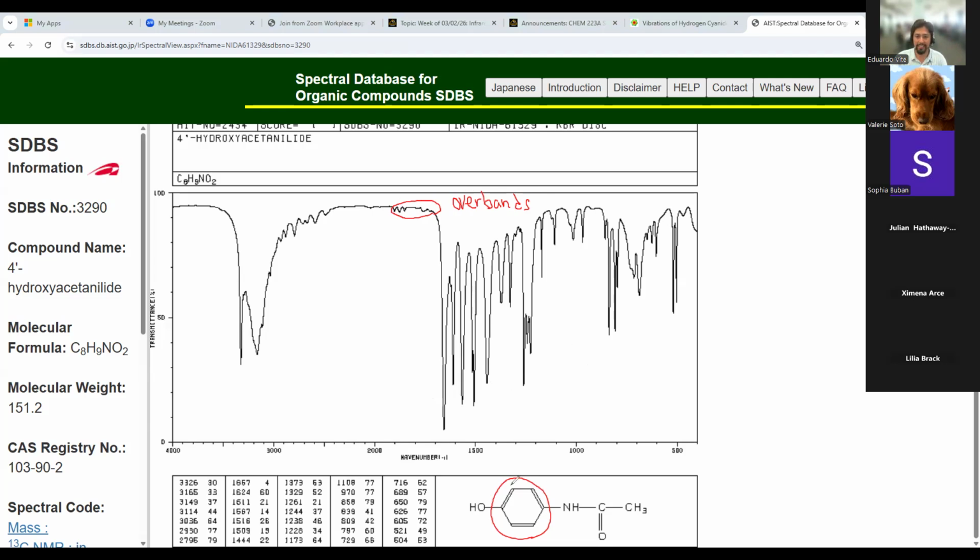And more specifically, the carbon-carbon double bond for the aromatic shows up at around 1500. So that would be most likely this one right here, probably this one right here, probably this one right here. Which of the three? As long as you pick one and you're in the region, you have a pretty good shot of being correct, right? I don't actually know, I'll be honest with you. I don't actually know which of the three it is, but I do know that it's between those regions. So I do know that it should be there.